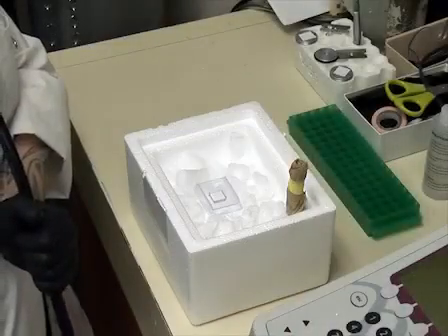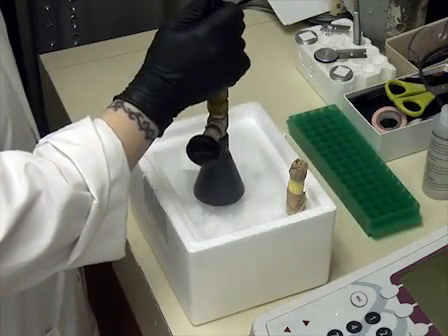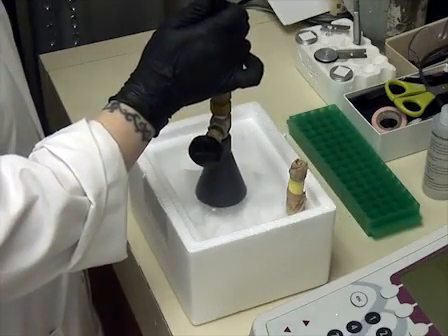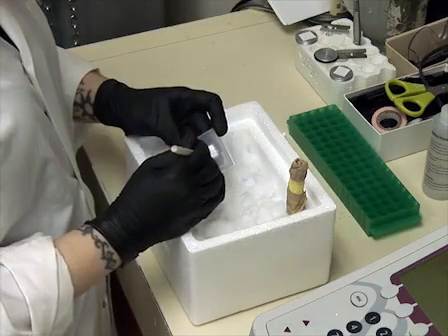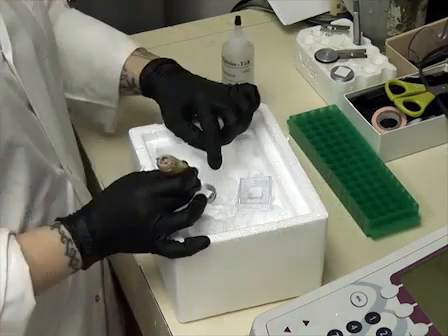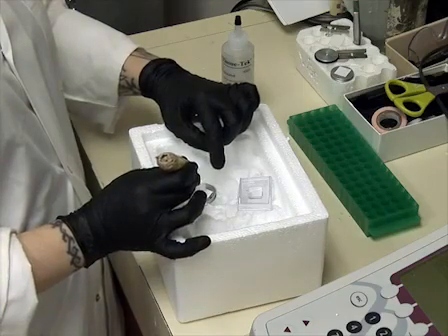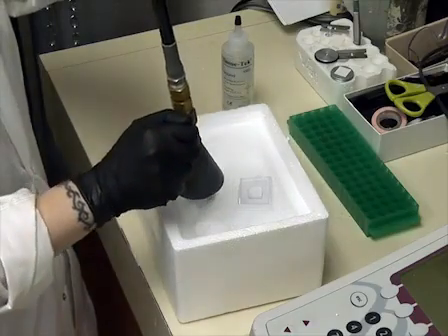Once 5 to 10 spheres have been placed into the mold, rapidly freeze them using CO2. Using the indications on the cryomold, mark where the neurospheres are located directly into the frozen OCT block. Remove the OCT block from the mold and place it onto the cryostat chuck. Fix the mold to the chuck using CO2 and place it in the cryostat.